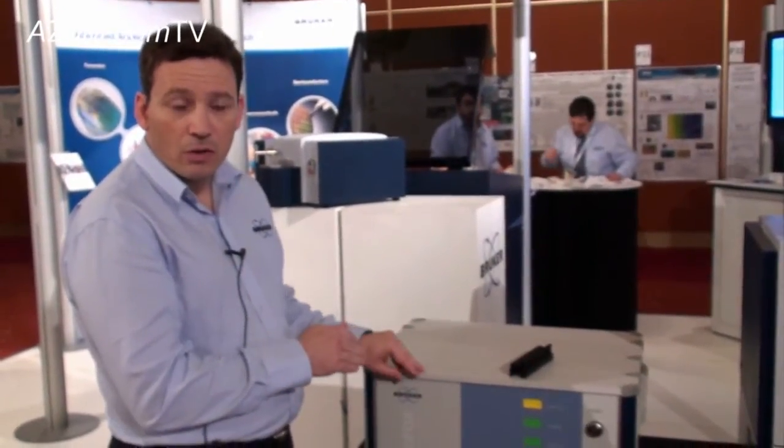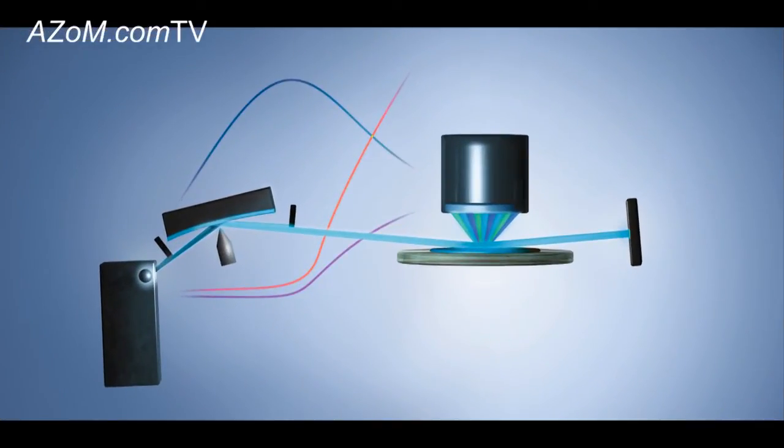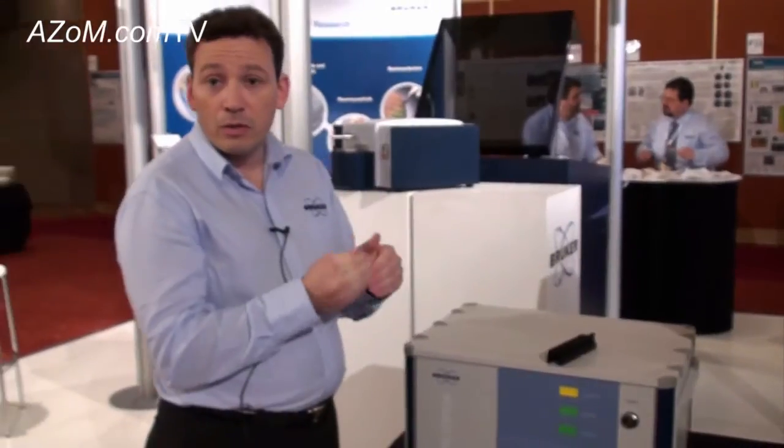The principle of this technology is that the x-rays are directed at a very low angle of incidence — less than one degree — and you get the x-rays reflected off the surface of the sample, which minimizes your matrix interferences or effects. So you get a very good signal-to-background ratio, and you get lower detection limits.